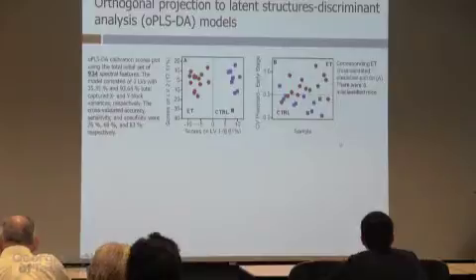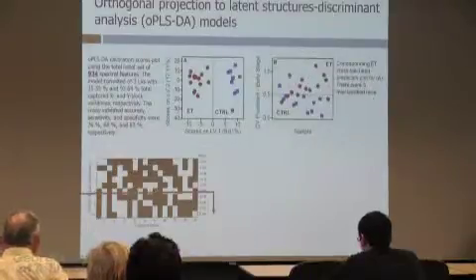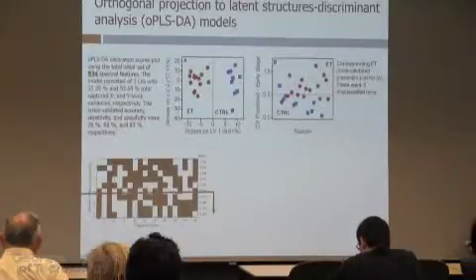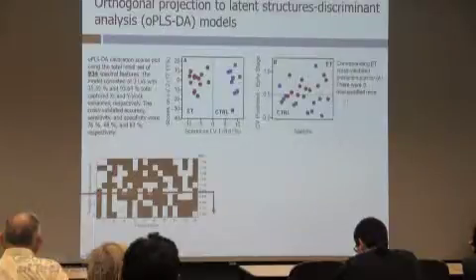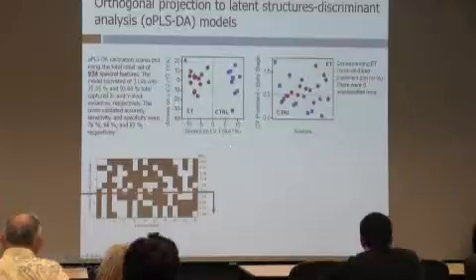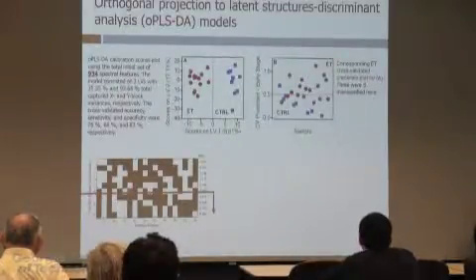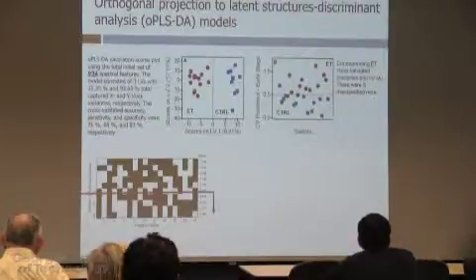So one way of looking at that is by using what's called the genetic algorithm. And I'm sure many of you know about genetic algorithms. If you've done some genomics work, it's used all the time. The idea is the following. We're going to take subsets of these 934. Let's say we're going to take sets of 90. We're going to make random sets of 90, let's say 200. And we're going to try them. Does this set work to separate? No. Yes. Maybe. So you're going to rank them. And you're going to see which sets work best and which sets don't work at all or are mediocre.